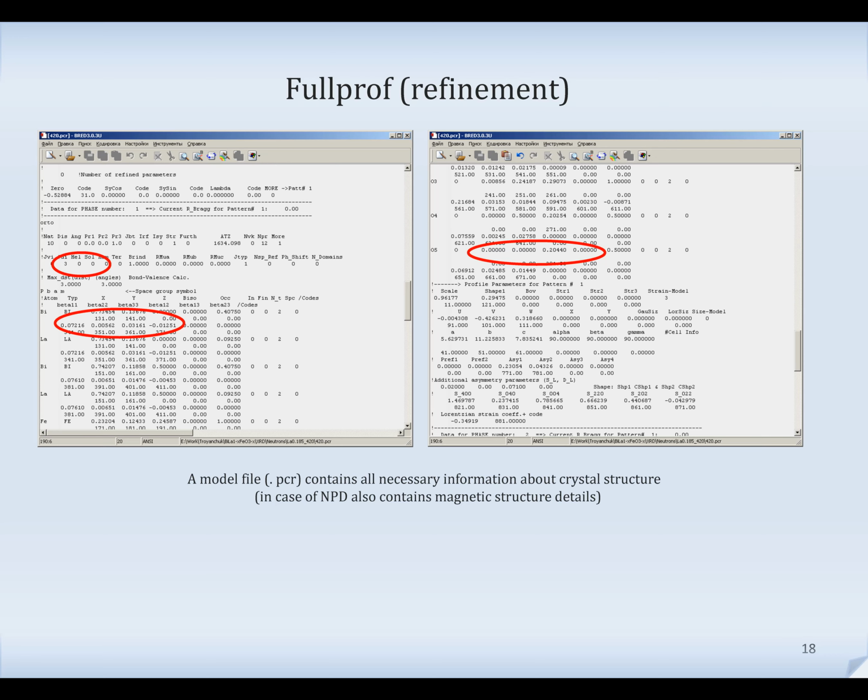Of course, I would say this is the final step of crystal structure estimation. And in the FullProf suite, there are a lot of programs which assist you to get this information. What is the space group of your compound? Roughly what are the parameters and so on. Then you put these parameters in a file and the software reads the file and simulates the pattern.